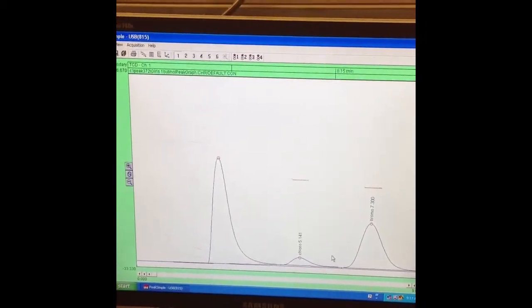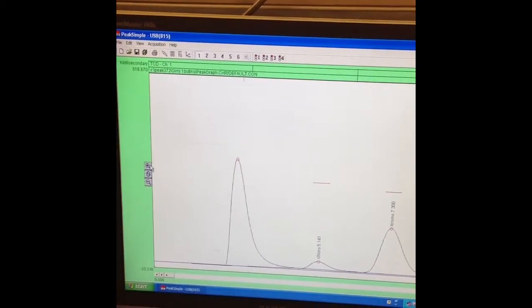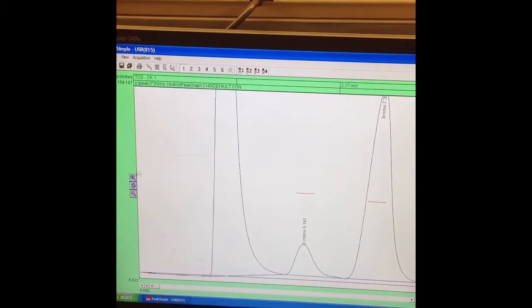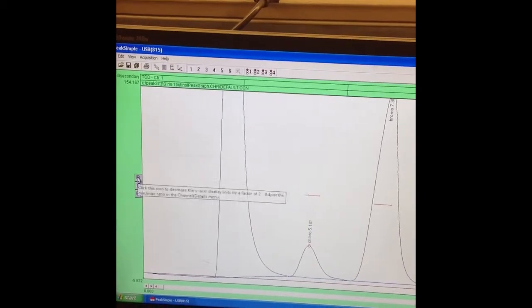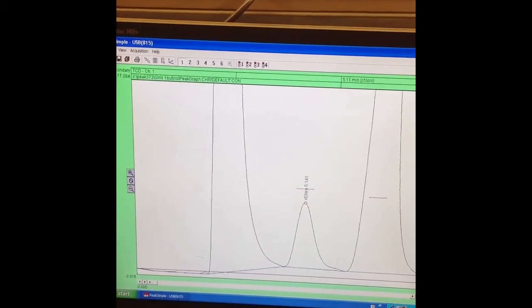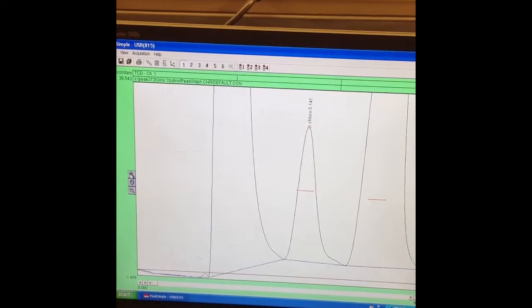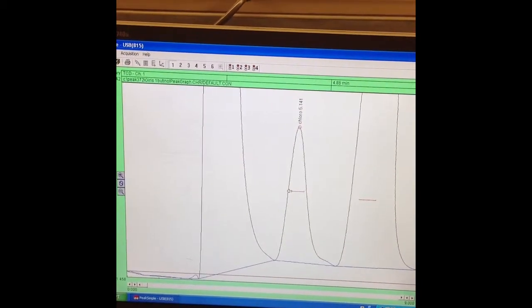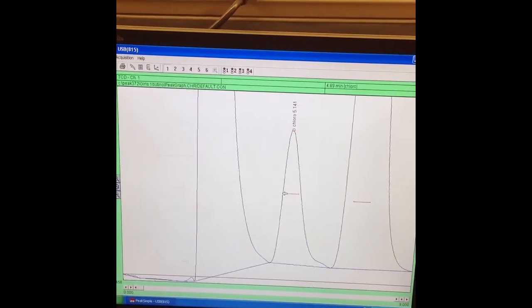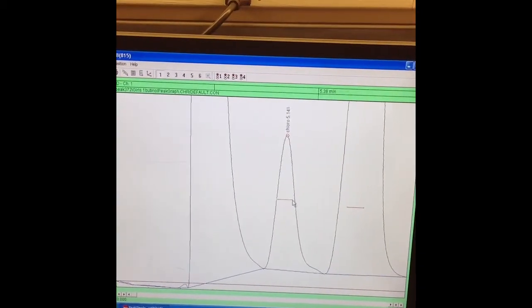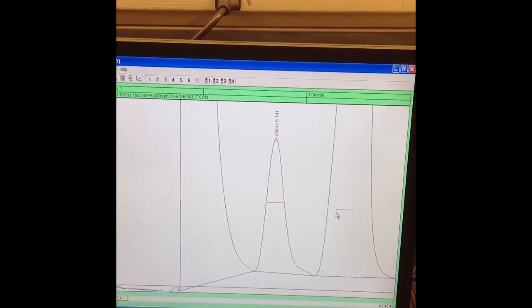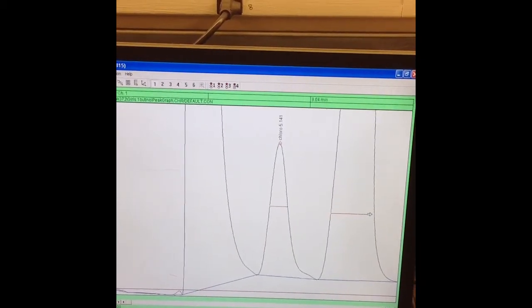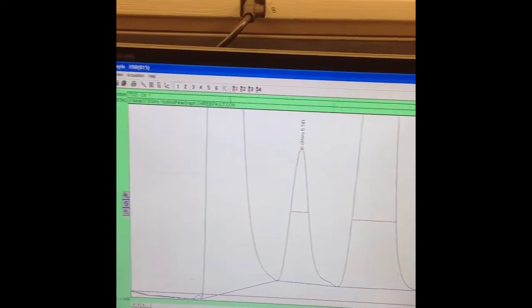Now I'm going to show you how to edit and integrate. First thing I'm going to do is I'm going to zoom in. And as you can see, the bromo peak will be clipped and the pentane, but we really want the red bar within the peak. So now that I've done that, I can edit the red bar by left clicking on each side and fitting it within the peak.